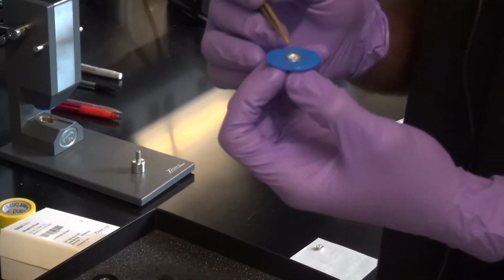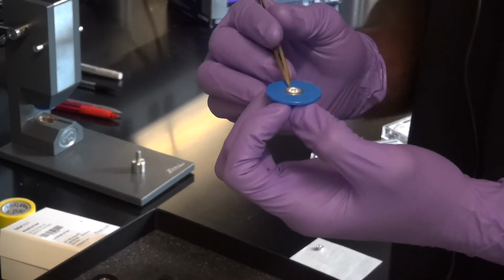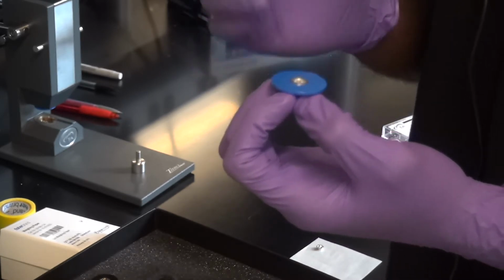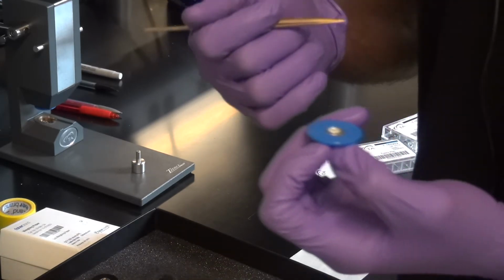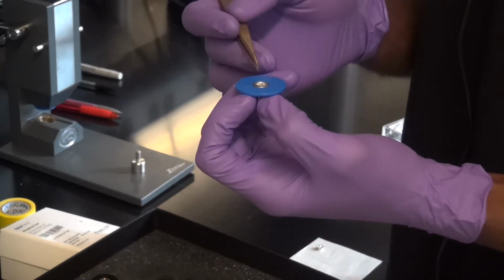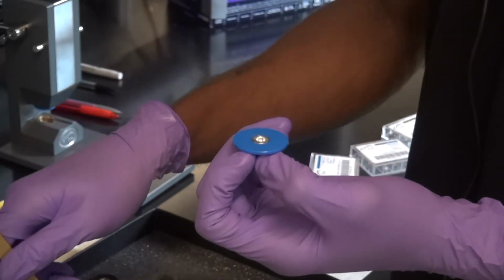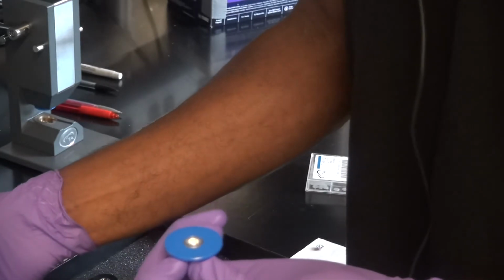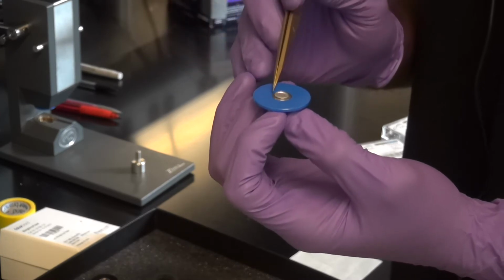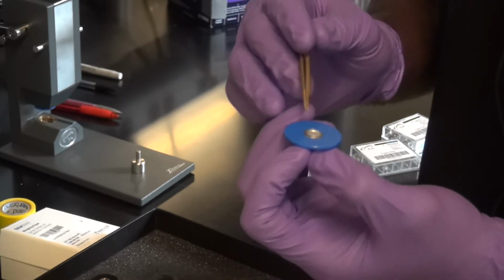Of course, be very, very clean. Make sure that the gel, even with the powders and things like that, are not all the way on the outside rim of the sample holder or of the pan, because if you don't clean it off, it will get into the DSC. So make sure that you stay clean when you're preparing the sample. And now you add your sample in here. You're going to take the lid, just like before. This time it's simply going to sit right on top of the pan. Okay? It does not push in, it just sits right on top.